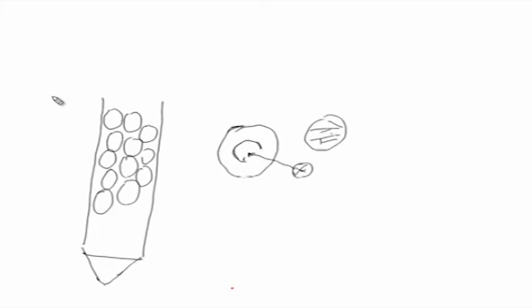So, larger molecules will only spend time in the interstitial spaces, the space surrounding the stationary support material, in which the stationary phase is contained.